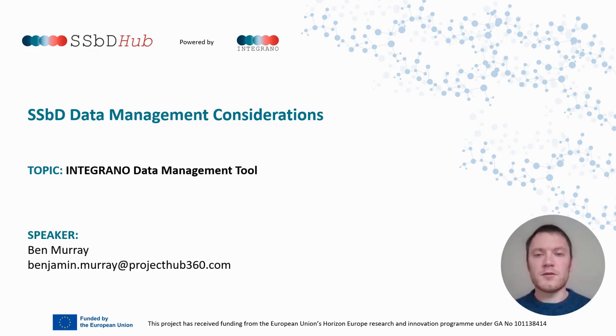So this video is to introduce you to the INTEGRANO data management tool, which is software developed by Project Hub 360.